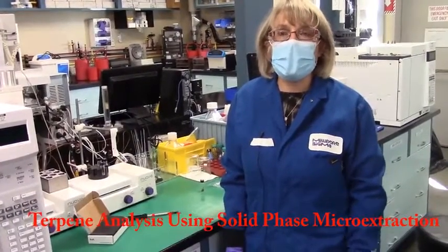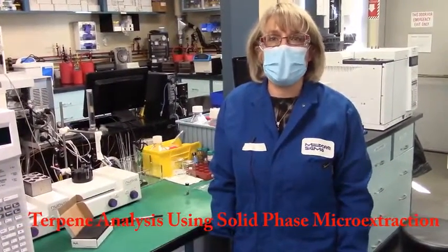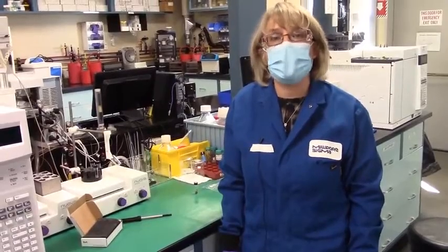Hi, everybody. My name is Kathy Stenerson, and I am an analytical science liaison with MilliporeSigma. And today what I'm going to demonstrate for you is how to use a technique called solid phase microextraction to sample terpenes from hemp flower.